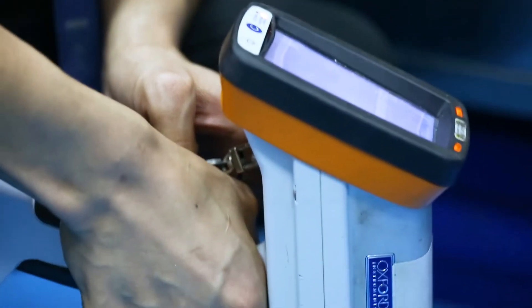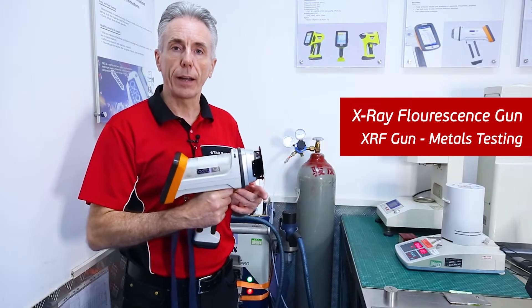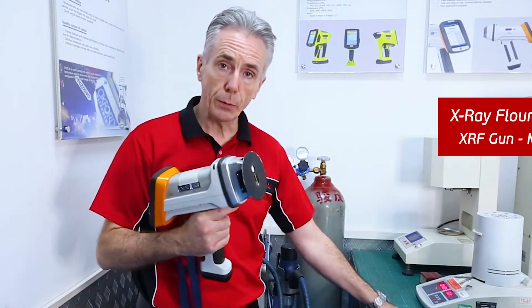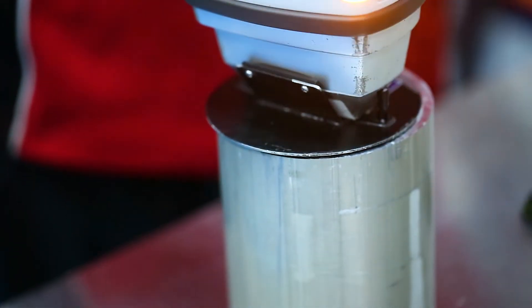Then we have this XRF gun — X-ray fluorescence gun. All elements fluoresce under X-rays. You can use this for metals inspection, but when you do the inspection it doesn't in any way affect the surface.